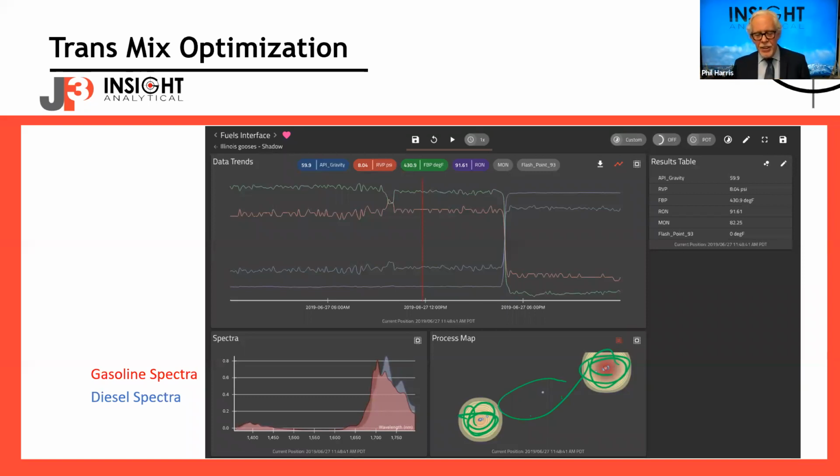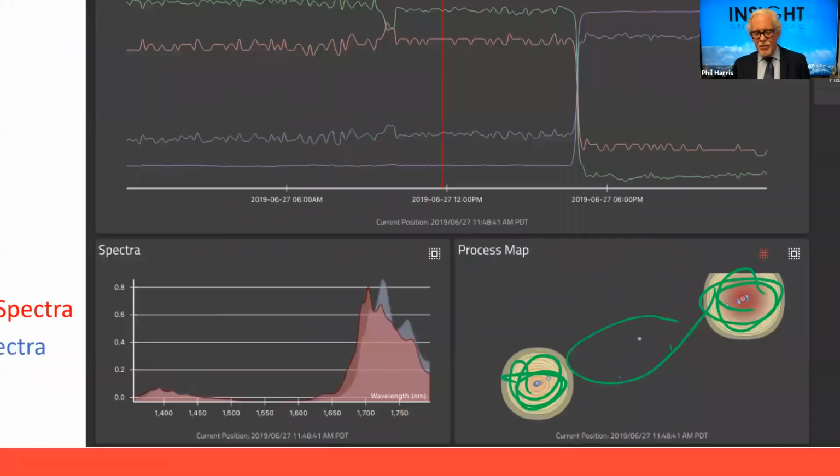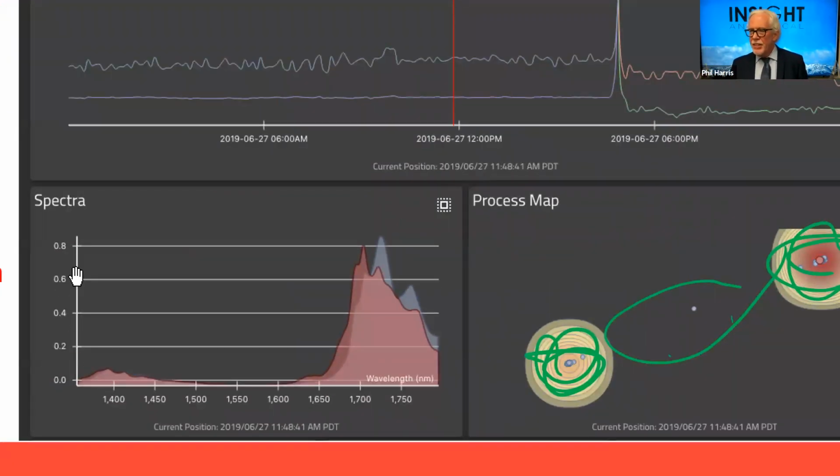The nice thing with this application is you can physically see that there are differences in the spectra, and what the analyzer is doing, what we're using principal components analysis to do in pre-processing, is to amplify those differences, figure out a way to model them, correlate those models to things we really want to know, and use that to make a wise decision over what we should do with this product.